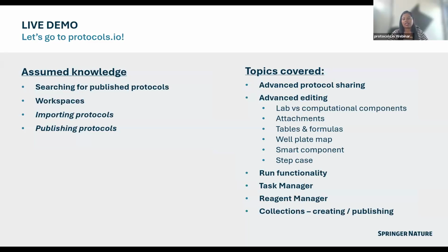As I stated earlier, it's a demo protocol. We'll be talking about the features, and I'll assume certain knowledge is already there. Even if it is not, I'll try my best to explain the small things required to understand the topic I'm discussing. So we'll be talking about these advanced topics. Let me go back to the demo. Give me a minute.